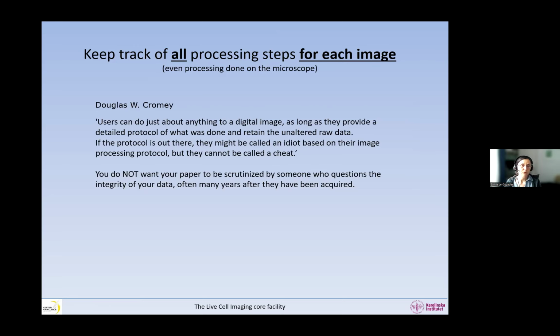So make sure that you document everything that you do, and that you do not have things like saturation, underexposure, bleed through, all these types of things. You must avoid them completely and write in your papers that you set your settings in such a way that you avoid all these microscopy artifacts. And you do not want your figure to be rejected because the images that you acquired 1 year earlier are heavily underexposed.